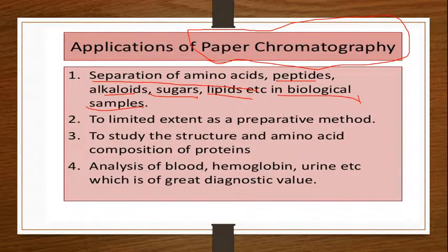to a limited extent as a preparative method, because it is very difficult to recover the sample. For preparative chromatography, you have to recover the sample, and recovery of a sample in paper chromatography is a tedious job. Hence it has a limited application with respect to preparative chromatography.